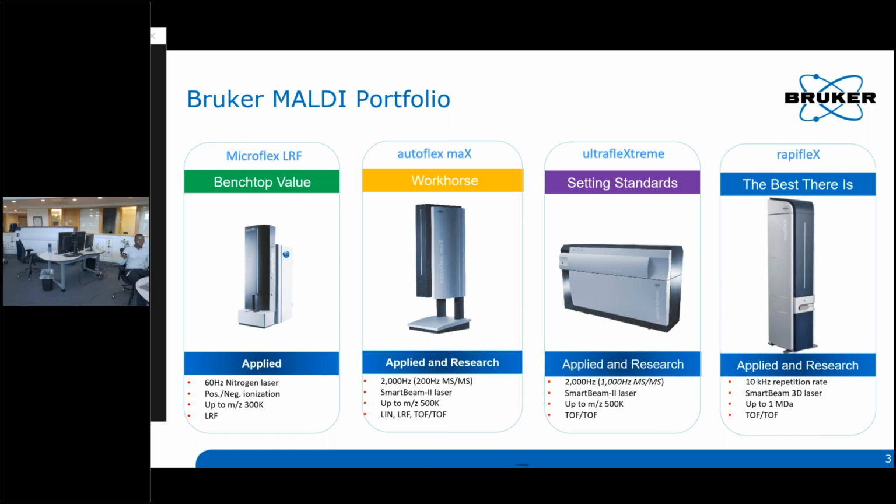And in front of me, the camera is a bit slow, but we'll get there. We have that tall standing Rapiflex, which is just coming into view. And next to it, there are a few other instruments, the TimsTOF Flex and the TimsTOF Pro and a few other LC ESI TOF instruments.